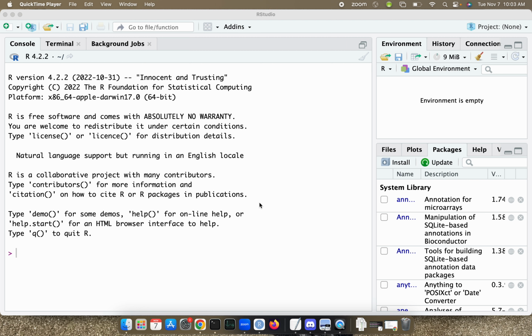Just wanted to make a video basically doing kind of what we did yesterday, but getting a little further into it and talking about the figures, and also talking about how to incorporate the figures into your reports and what the expectations are around how to talk about those figures in your report.